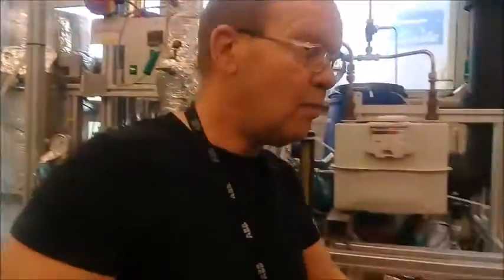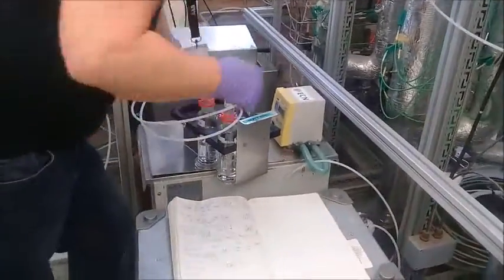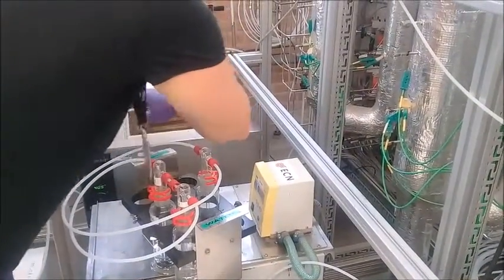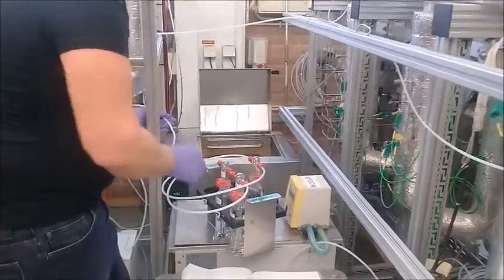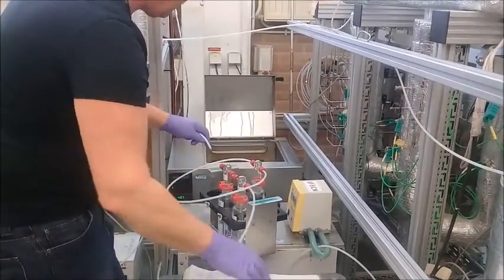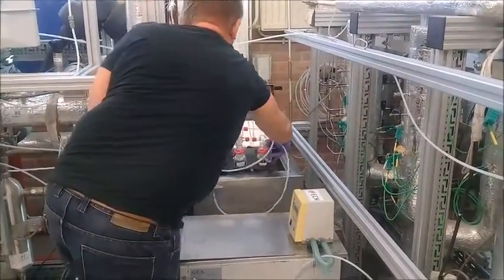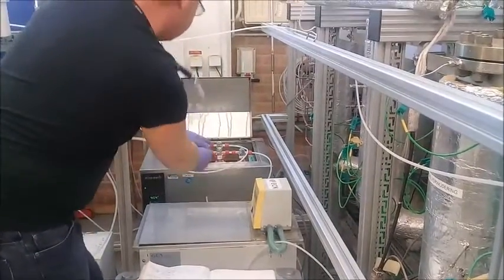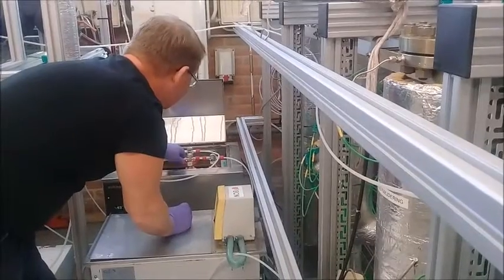So here we have the washing bottle rack I was previously talking about, and this is the water bath in order to heat up the first aerosols. The water bath is at +40 degrees. And we will now place the bottles into the bath, just like that. And we put it on the sampling line in the first bottle.